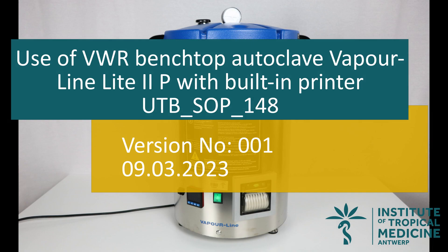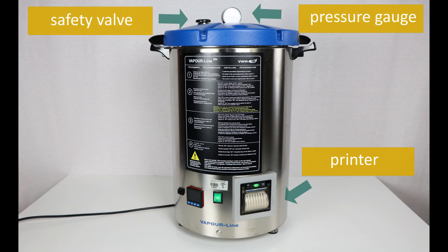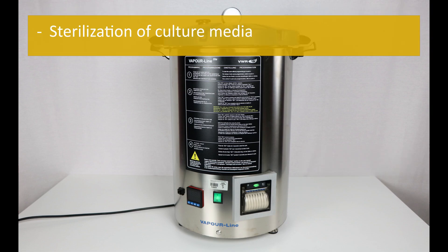Use of the VWR benchtop autoclave Vapour-Line Lite II P with built-in printer. Scope and application: the VWR benchtop autoclave Vapour-Line Lite II P is a semi-automatic steam sterilizer with a capacity of 23 liters and a built-in printer for sterilization of material at 121 degrees Celsius and a maximal pressure of 1.08 bar (15.37 psi). This procedure explains how to use the VWR Vapour-Line Lite II P benchtop autoclave for sterilization of culture media.